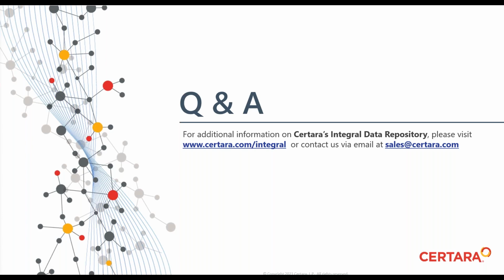Yeah, thank you, Michael. Great presentation, very insightful. As a reminder, please submit your questions through the chat panel. We still have a few minutes left to cover your questions, and 2 questions already came through. So let me read this to you, Michael. First question is, can data/files be deleted? For example, in outdated analysis that should not be used or referenced.